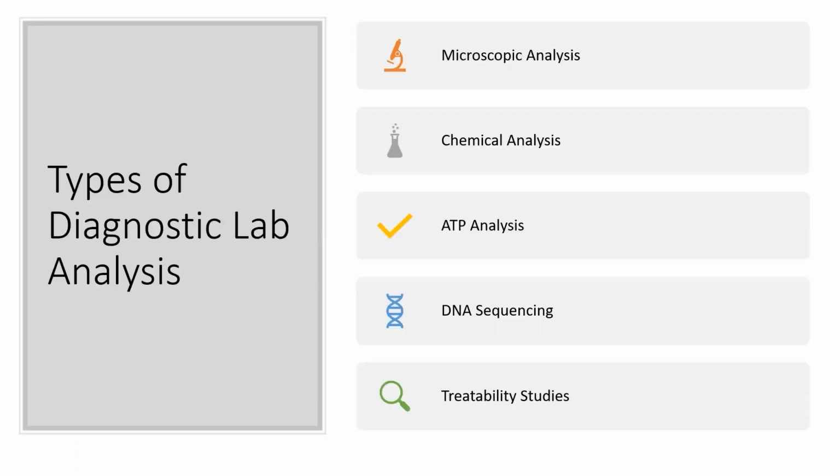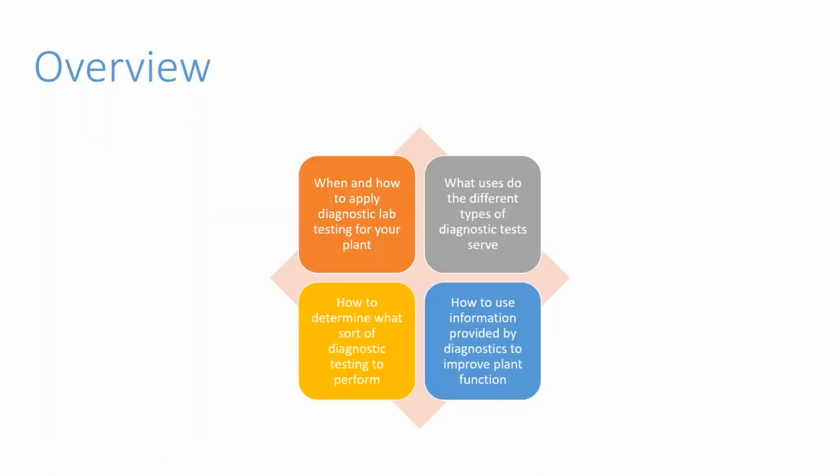So a couple other things we have here broken under chemical analysis: we have ATP analysis and DNA sequencing I like to talk about a little bit, and then we have treatability studies.